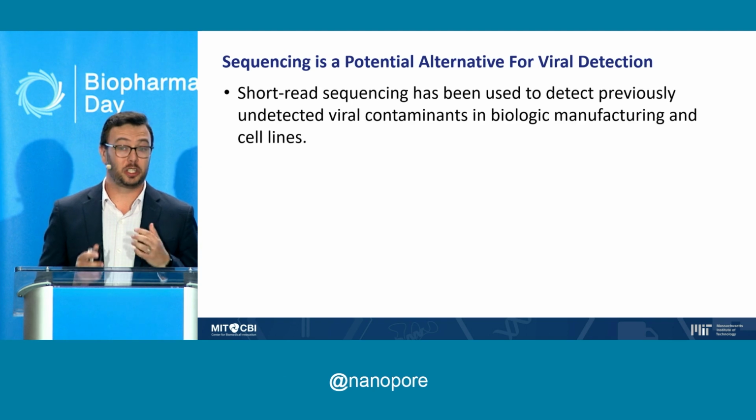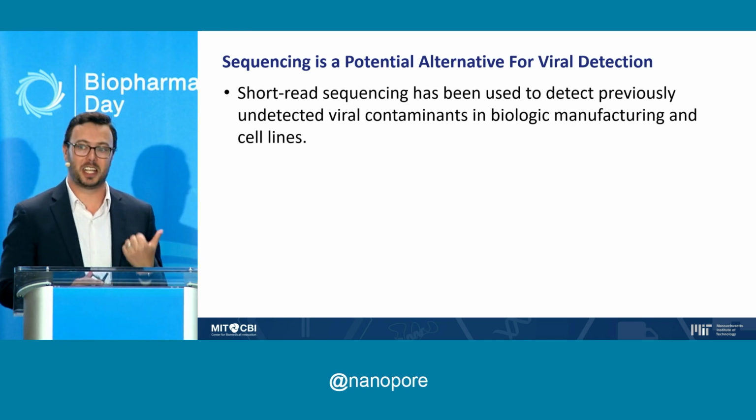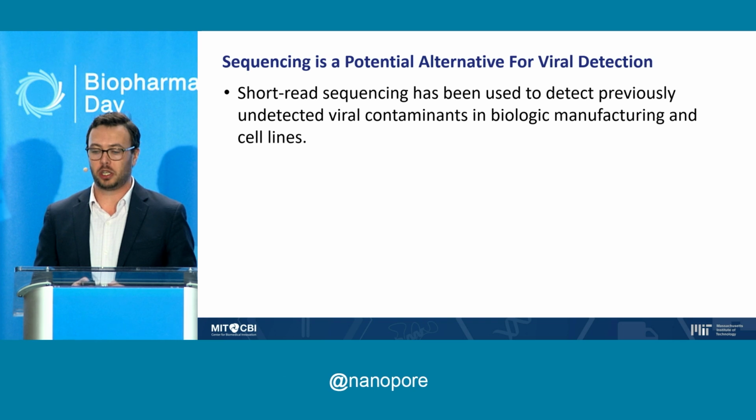Okay, so clearly there is a need for a better assay that is faster and doesn't necessarily sacrifice animals in the process. And so sequencing is certainly a potential alternative for this.